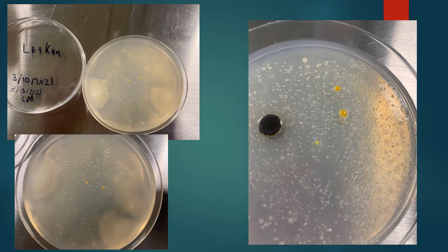On the left is my results on the 18th of March, where you can see the yellow dots are on top of the petri dish, which would normally be quite hard for bacteria to grow on since the antibiotic Kanamycin is there, which would usually negate antibacterial growth. And then a week later on the right is my results where some mold has grown, but that's normal because it's been left at room temperature over the course of 2 weeks. And this petri dish has really strong growth on it. And since it's growing over top of the bacteria, it's not being interfered with by the antibiotic.